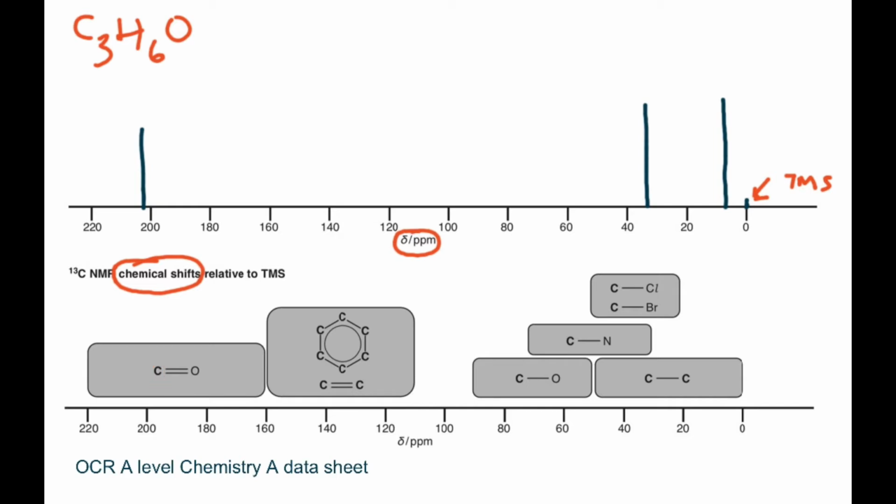Quite often when students are given a carbon NMR spectrum, they spend a lot of time analyzing it. But actually, you should start with the formula. You've been given a molecular formula. There are only 3 carbons, and your job is to identify what the molecule is that's made the spectrum. With only 3 carbons and not many hydrogens, you're either looking at a ketone or an aldehyde.